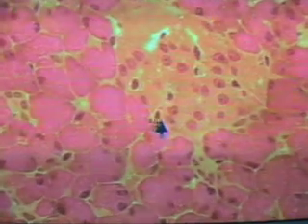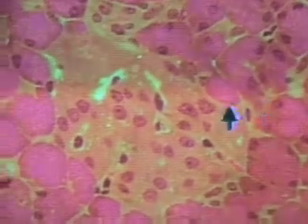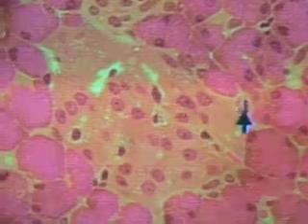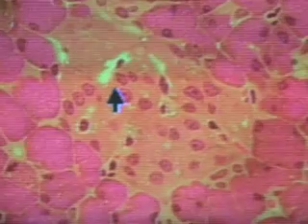So most of the cells you'll see in this accumulation will be beta cells. The alpha cells are usually found at the periphery of the islet. This looks like a slightly different type of cell, and there's one right there that's a little different, and then around like that.